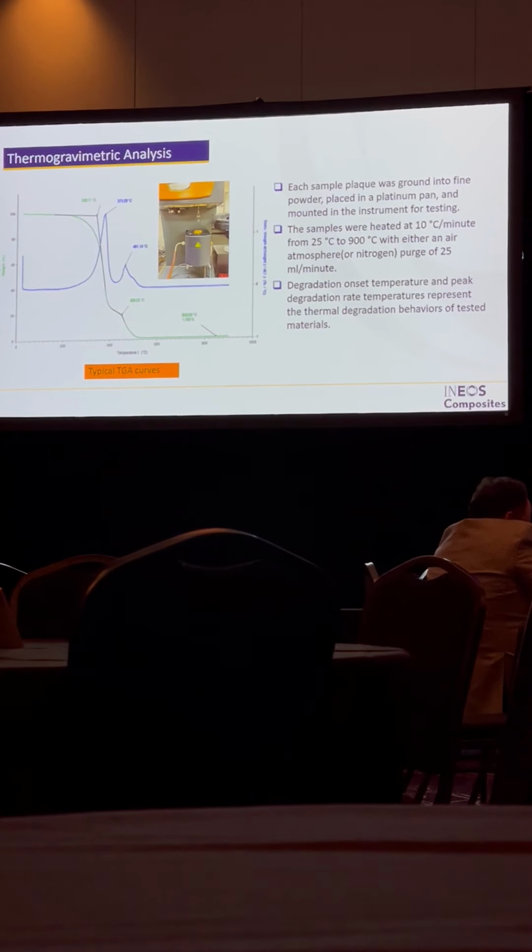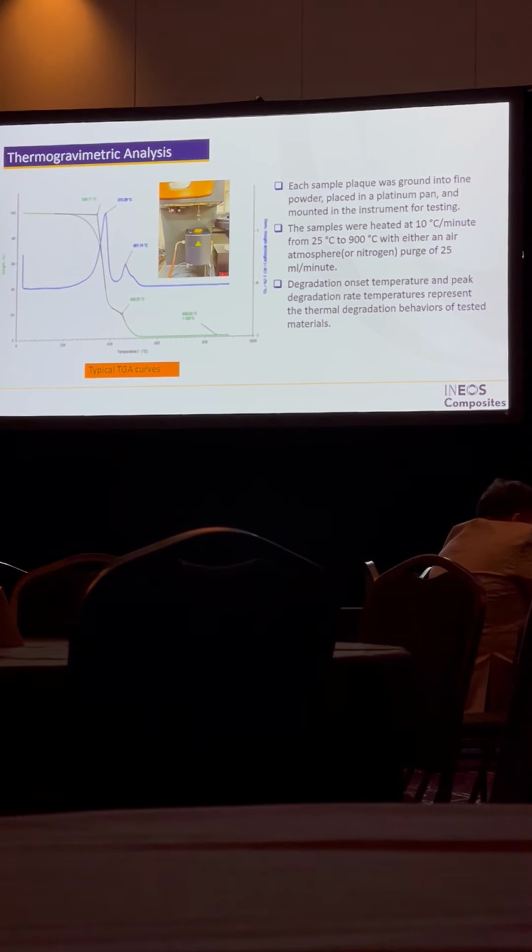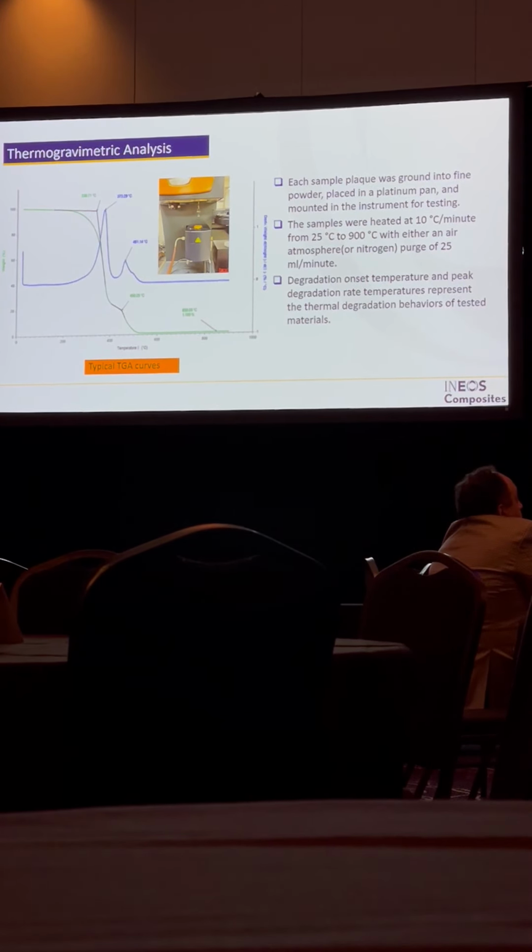So at the end of the test, the equipment will provide a weight loss curve as a function of time, as a function of temperature, as shown in the green curve here. From that curve, we can define the thermal degradation onset temperature. Here you can see in this specific curve, there are 2 thermal transitions. The first started at 338, the second started at 450, around that range. At the end of the test, above 800 degrees C, there is a residual weight retained in the sample, and that's related to the char formation that he will talk about later.